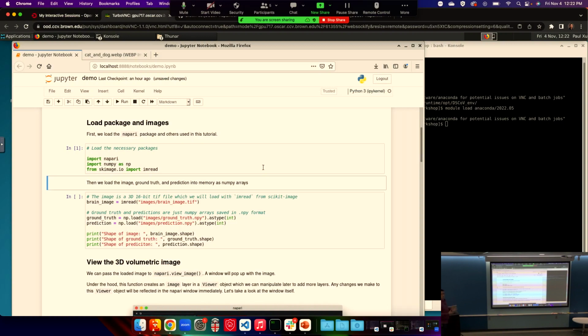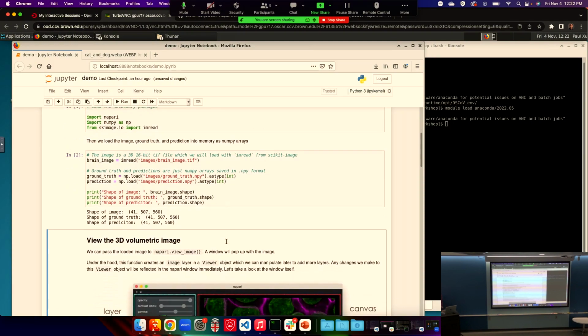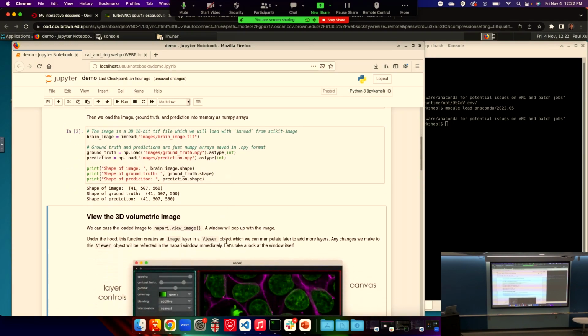You can think of it as a 3D cloud of ones among a sea of zeros, and wherever it is 1, it is basically just a prediction of a cell nuclei there. So if you load everything, you can see that the dimensions of the image, ground truth, and prediction are the same. So that sets up for us to put one of them on top of each other.